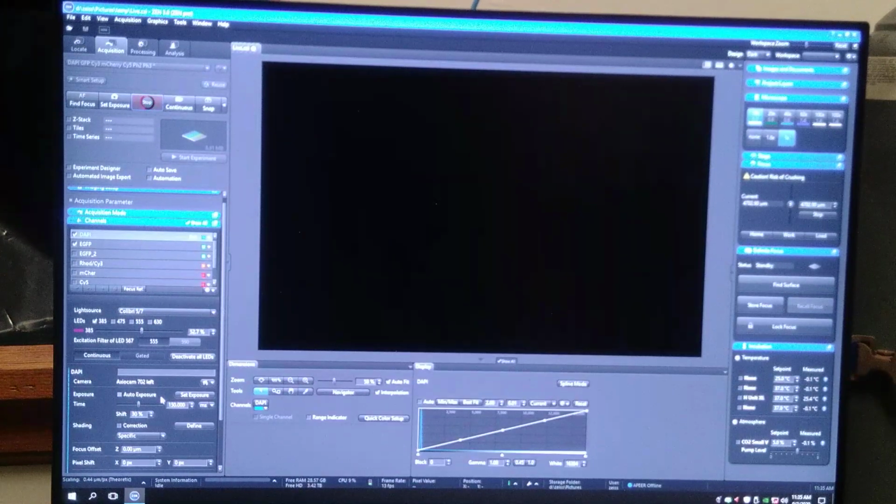So whatever is highlighted is going to be the excitation emission wavelengths for DAPI. And then down here, you can either use auto exposure or you can change your exposure. After you set this bar, either by auto exposure or by the slide bar, you do not need to do anything more. That's where it will stay when you click snap. If you set exposure, then it sets it by itself and it changes what you wanted down here. So only set your exposure here.